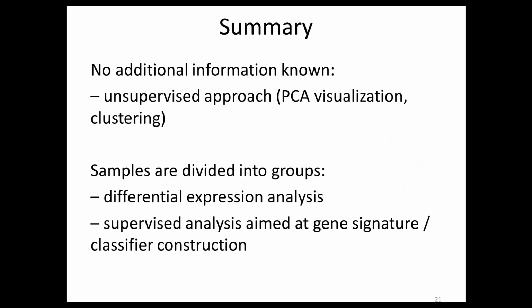Okay, so now some summary. What we have done today. First, we have analyzed some approaches to obtaining expression level tables. Then we spoke about differential expression analysis, about DESeq2 and edgeR, and then we talked about supervised and unsupervised analysis. If we do not have additional information about groups, we can apply an unsupervised approach, for example, PCA visualization and looking just at the picture, or hierarchical clustering, or some other kind of clustering. And if the samples are divided into groups, we can perform supervised analysis to understand to which class, to which group a new sample belongs.